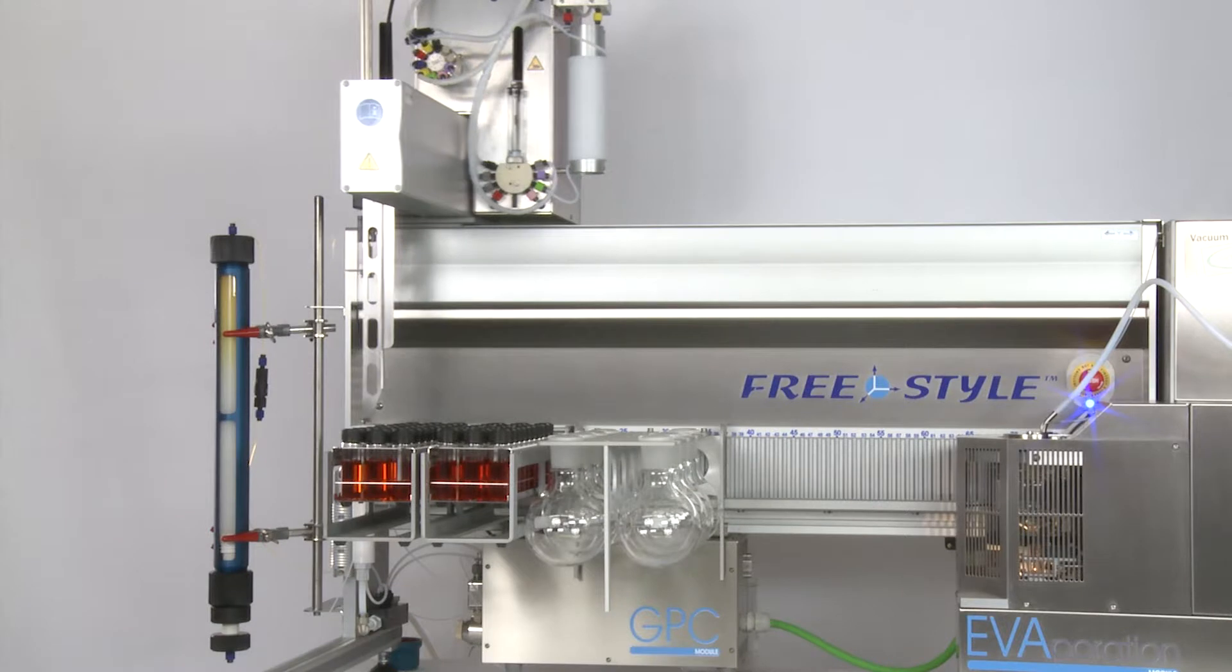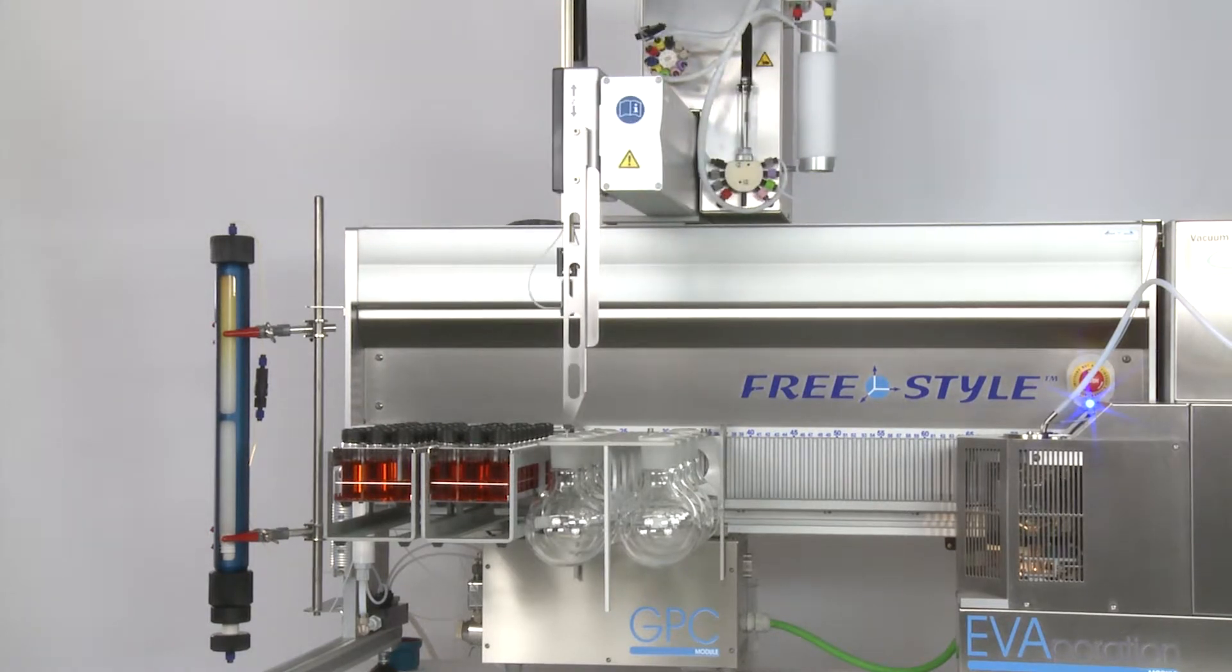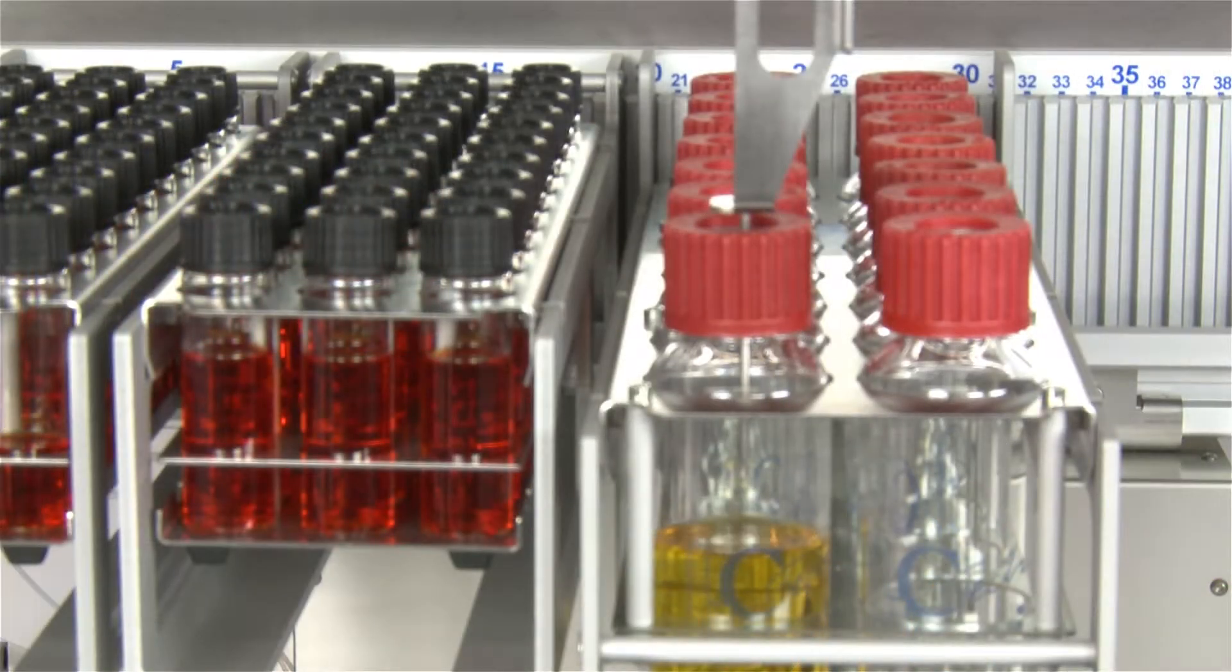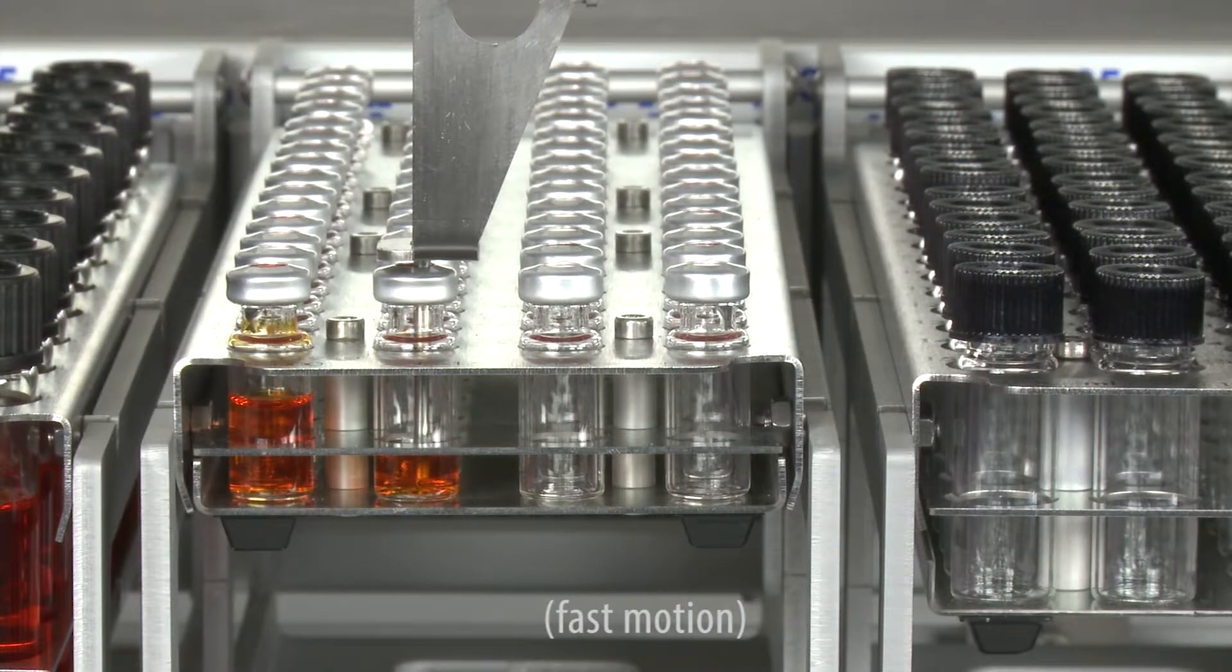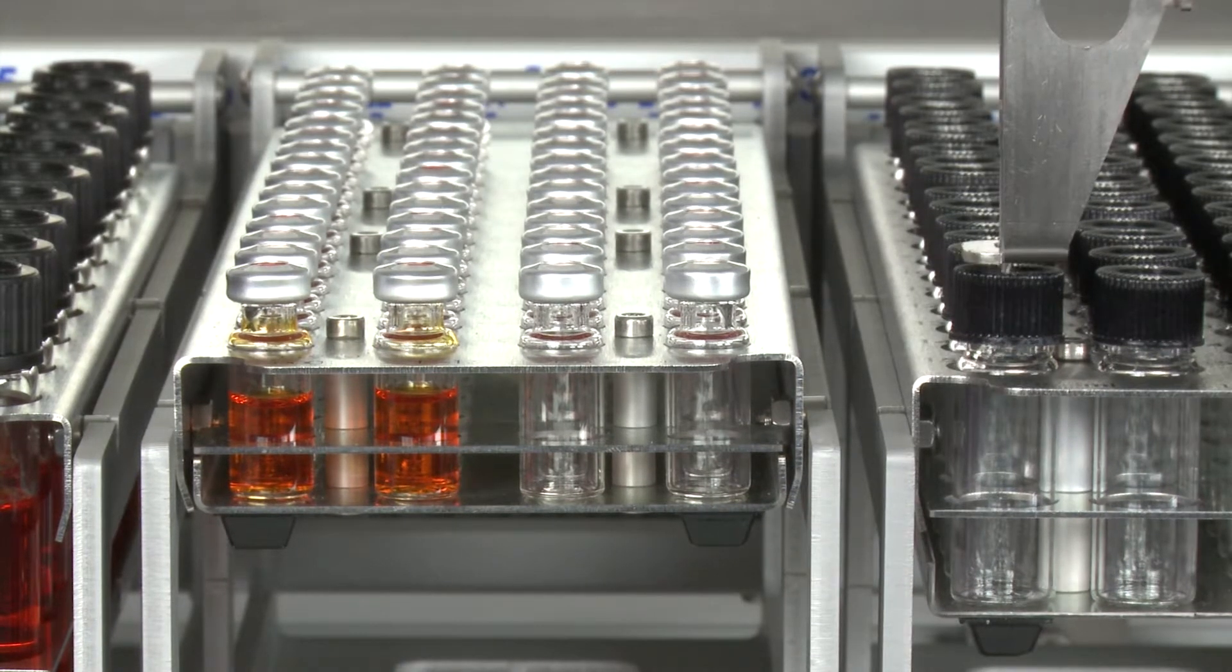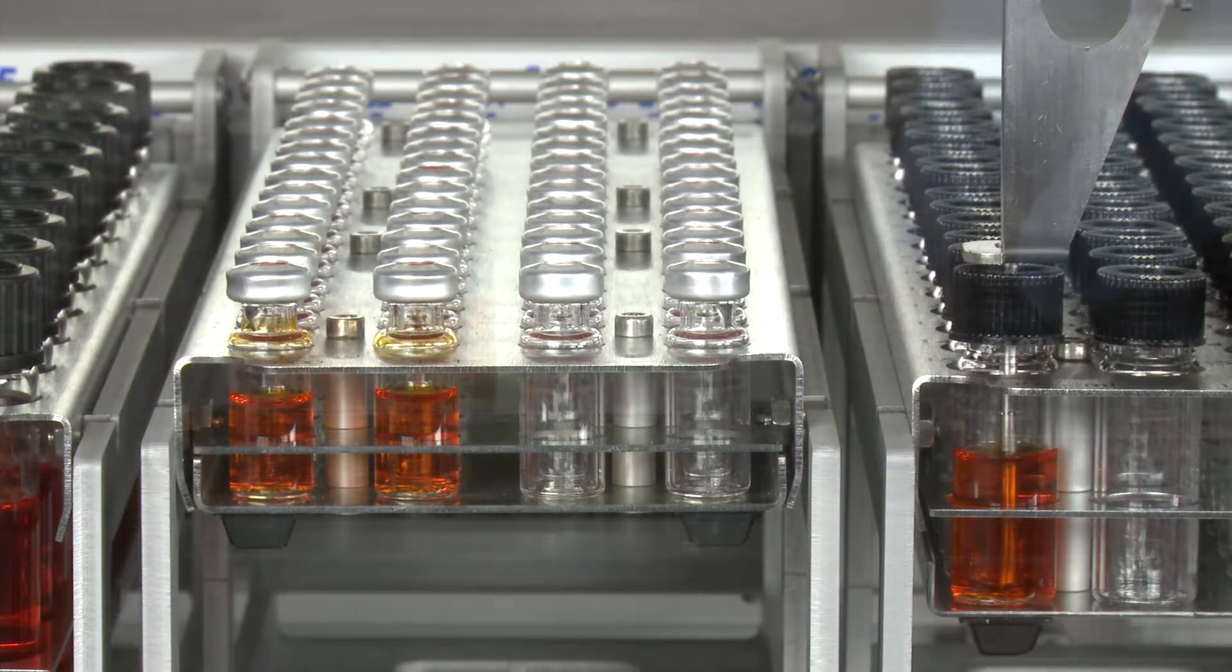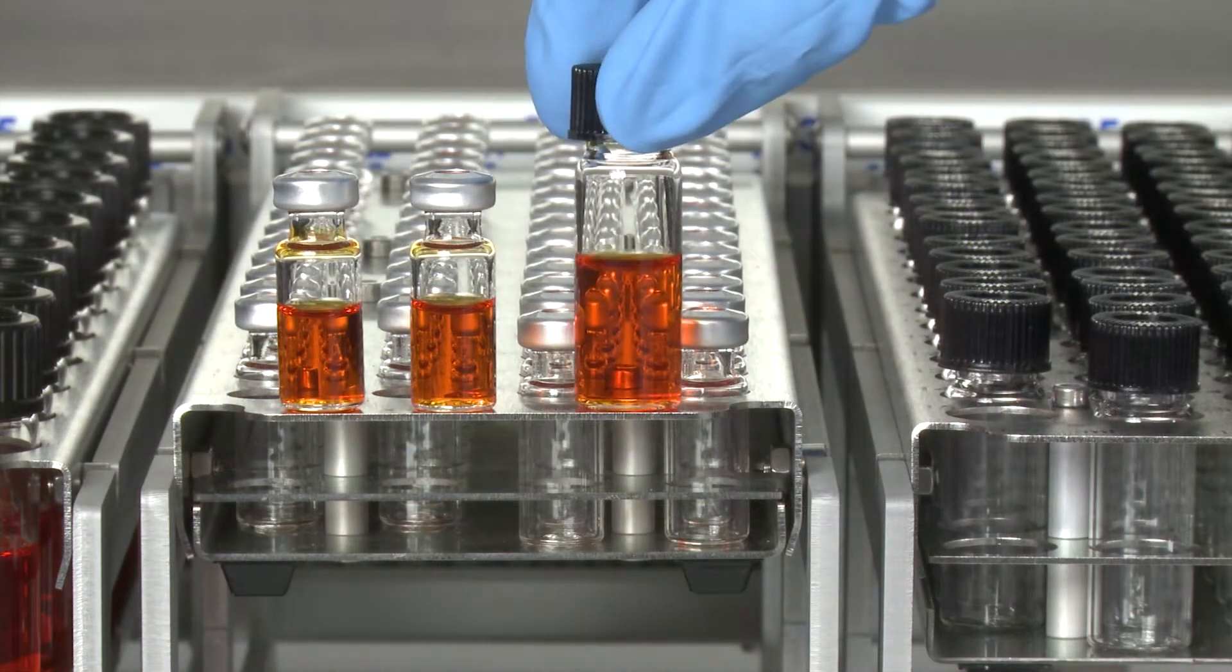If further processing is intended to be performed with the rotary evaporator, you can collect directly into an appropriate flask or in a sealed bottle. Or, you could concentrate online in the evaporation module with an optional solvent exchange and fill into the required containers.